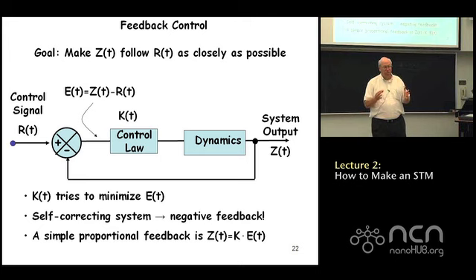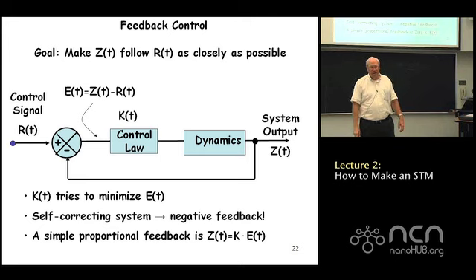But what you have to do is build a feedback circuit which takes a set voltage that you specify, compares that set voltage to the tunnel current that is measured by your scanning tunneling microscope, and then adjusts the position of the substrate with respect to the tip to make the tunnel current that you're achieving equal to the set tunnel current that you specify, right?